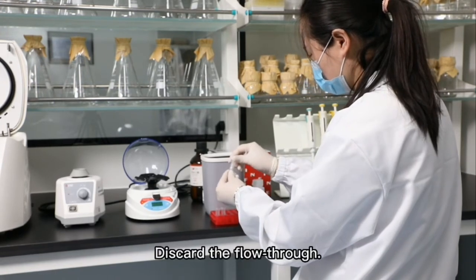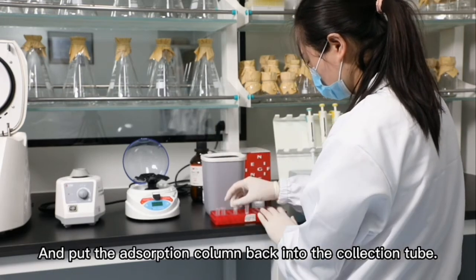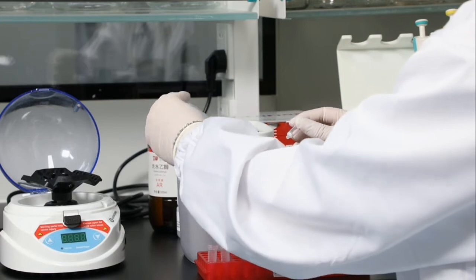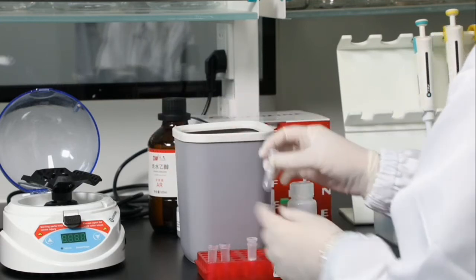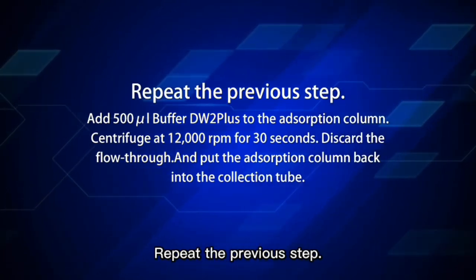Discard the flow-through and put the adsorption column back into the collection tube. Repeat the previous step.